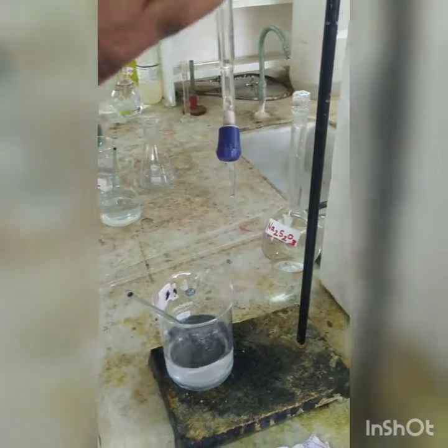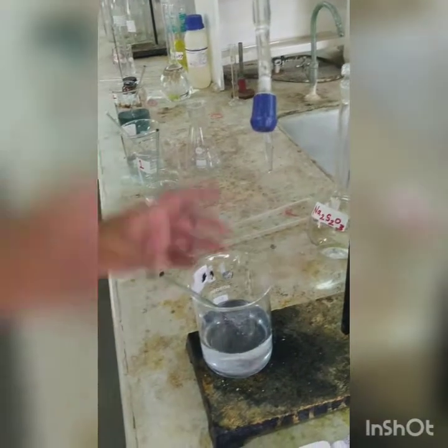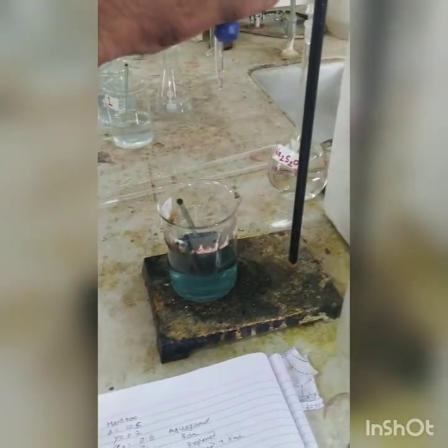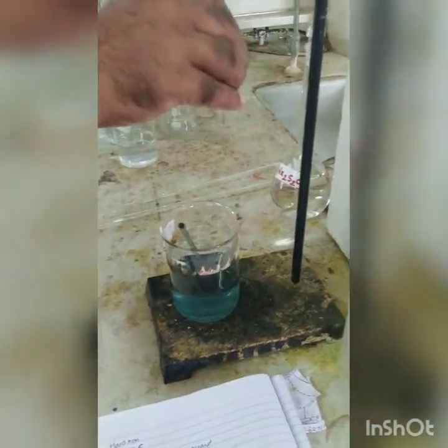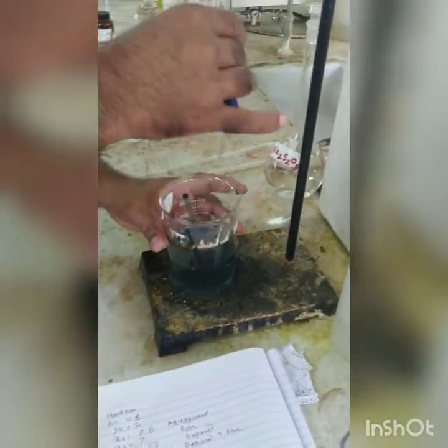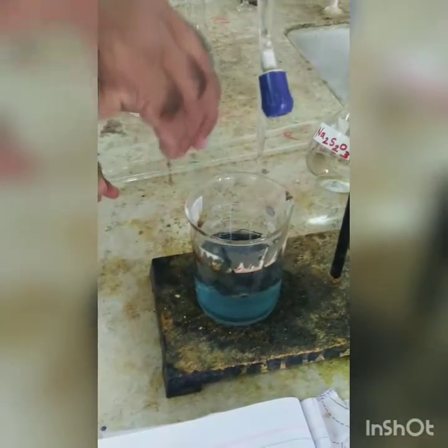How much is the reading? 6.6. Then go to the fourth sample. You can see as the dosage is increasing, the ml of titrant required is also increasing.